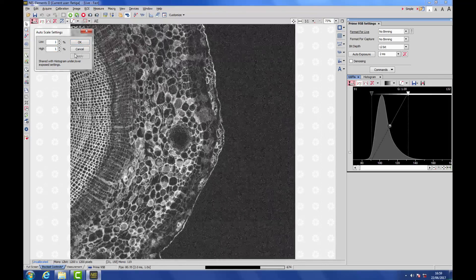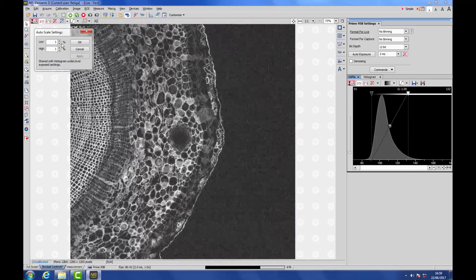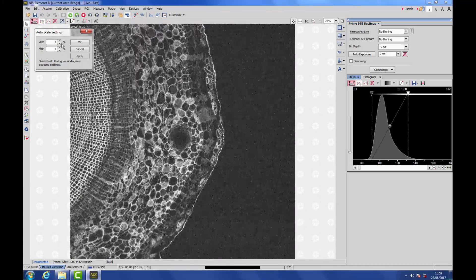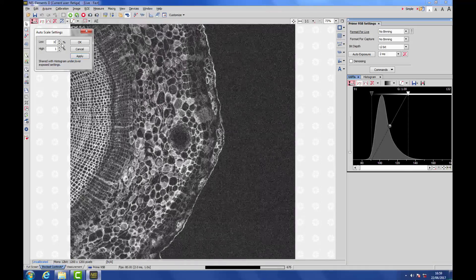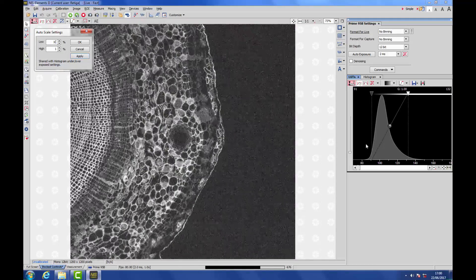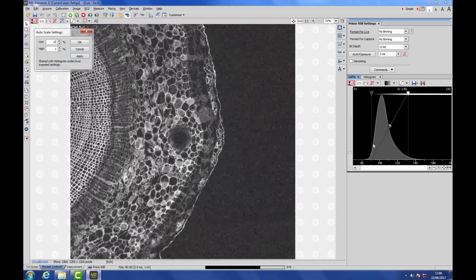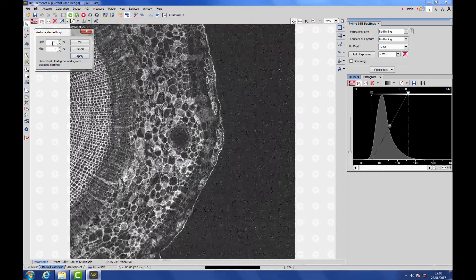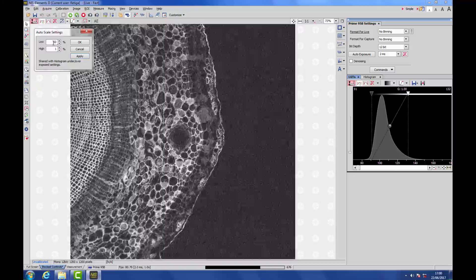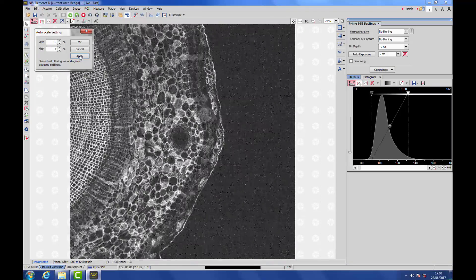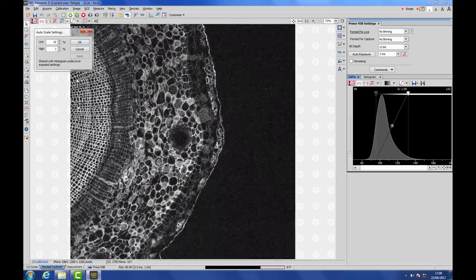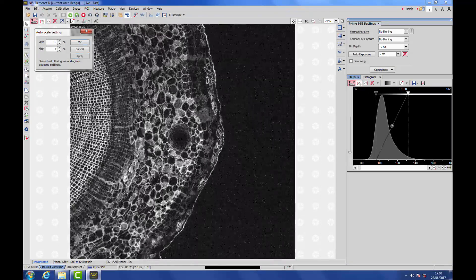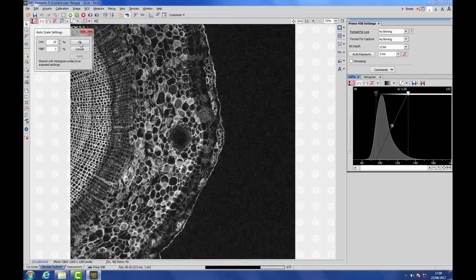If we change this to 1, instantly we get a better picture. But to get the most contrast out of the image, we need to ignore as much of the bottom-end noise as possible. That means setting the proportion of the darkest pixels that we ignore to the maximum value that Elements will allow, which is 10%, and you'll see instantly our contrast pops a little bit more.